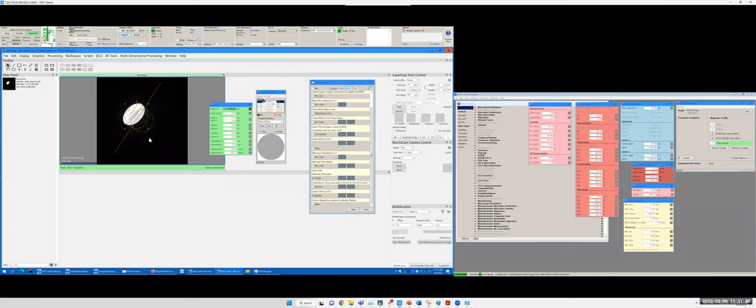I draw two circles. You can see under two extreme conditions, those two circles don't overlap. So the idea is to make those two circles not a circle anymore. It's actually a distorted version. So we want to make sure they overlap as much as possible. So now it's the perfect case, right? You can see this is aligned.